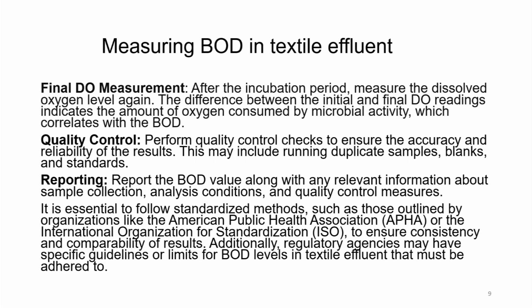Final DO measurement: after the incubation period, measure the dissolved oxygen level again. The difference between the initial and the final DO readings indicates the amount of oxygen consumed by microbial activity, which correlates with the BOD.